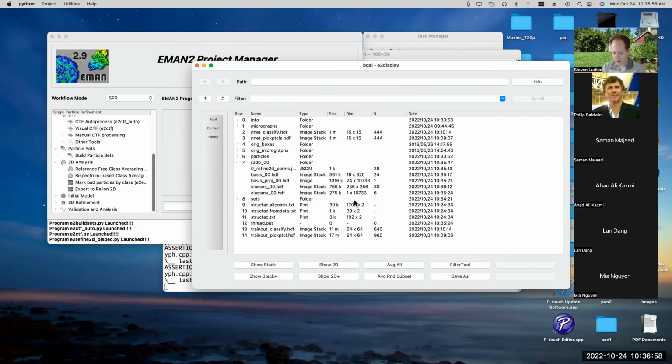All right. I think next week we should pretty easily be able to. I mean, we've got the class averages. Making the initial model shouldn't take very long at all. So I'll go ahead and run this on my machine. We'll at least have a reference run on my machine that we can look at, so we won't have to wait for the refinement runs to run during the 1 hour period next time. So I think we'll finish off the single particle analysis in the next meeting, and then the meeting after that we'll do the subtomogram average.